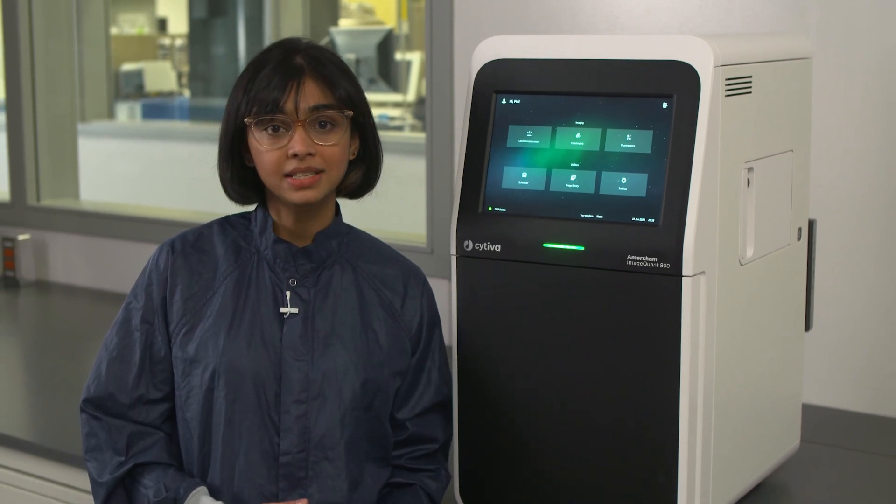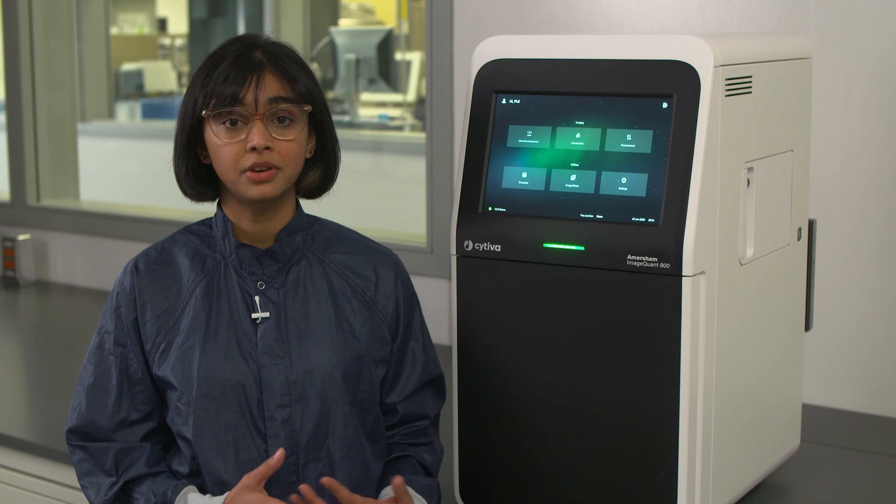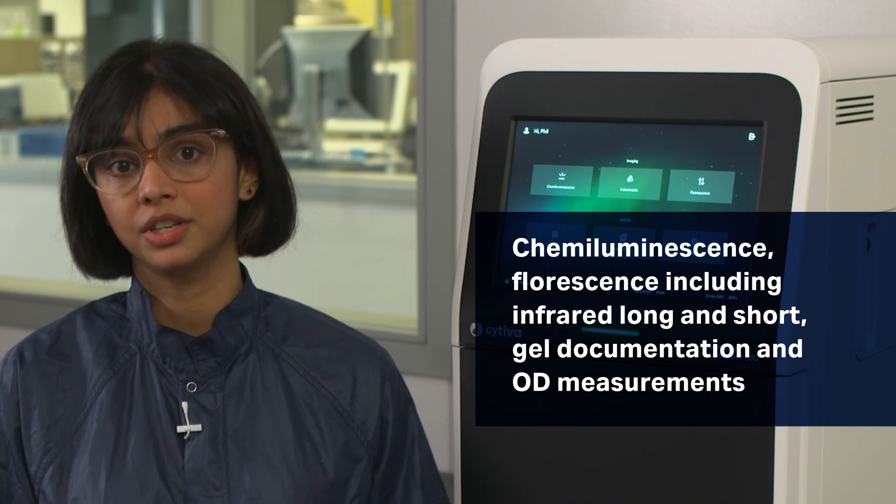It's fitted with a really sensitive Fujifilm lens and a high resolution 8.3 megapixel camera. It's available in four different models based on your convenience, and the imager is capable of chemiluminescence, fluorescence including infrared long and short wavelengths, gel documentation and optical density measurements of stained colorimetric gels.